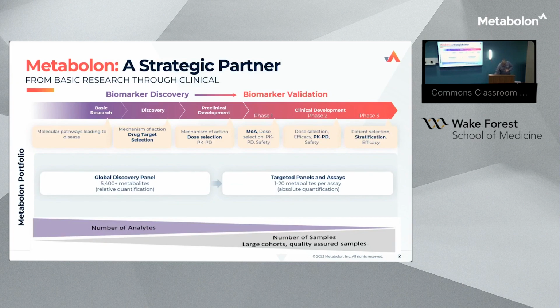So I'll just quickly get a pointer here. When we think about the clinical pipeline as we have it at the moment, or drug development pipeline, we start on the far left side, really with the discovery, exploratory approach that Nicole and Annie talked about quite a bit here. And so that is very much, we want to look as wide as possible at as many different metabolites and be able to use that big data and connect it to other clinical data or other omics data.